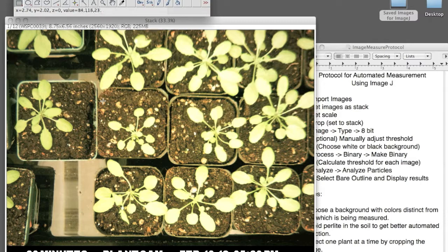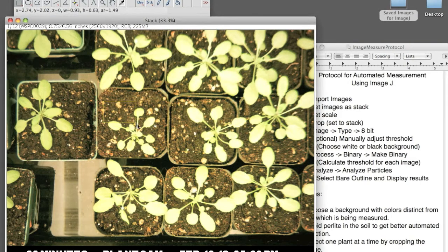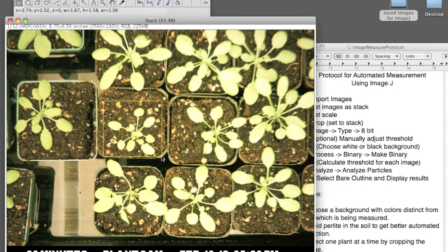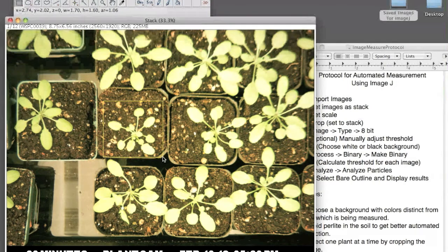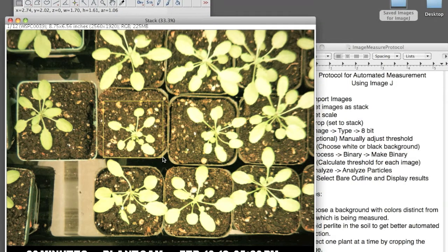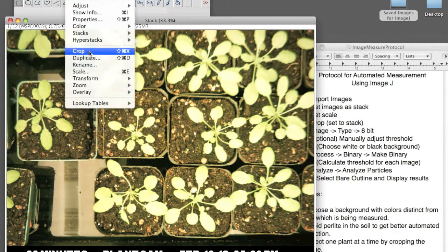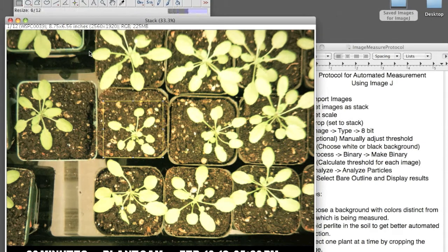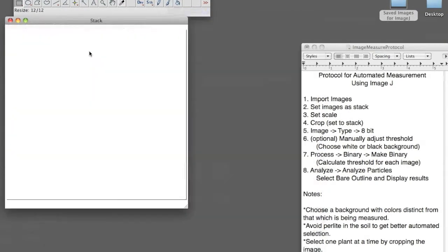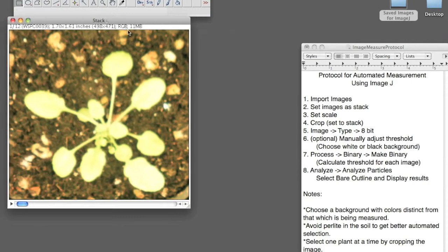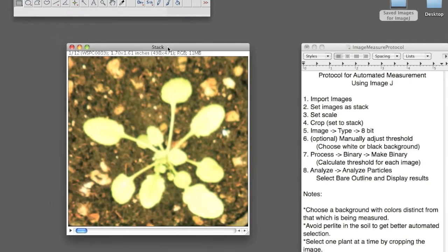Now that you've set the scale, you want to crop, so you select the Rectangle Selection tool, and you crop. And the reason I'm only using one plant in the photo is it'll make the output of the data easier to understand, or else it can get a little bit confusing.